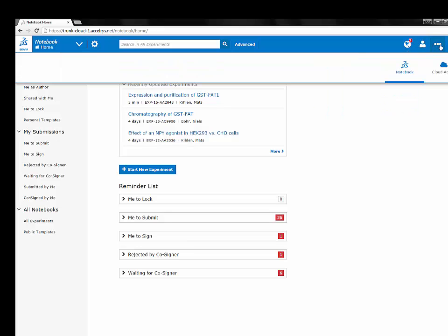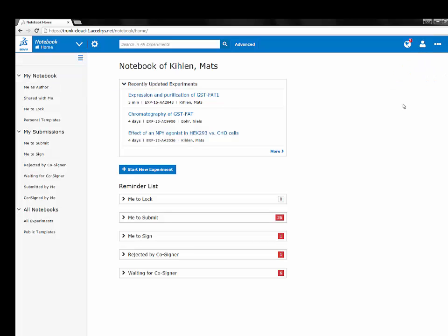To the right you have personal settings, the navigation between different apps, and then finally logout. The logout button is available throughout the notebook. By clicking on a predefined filter on the left hand side you can jump straight into the library.